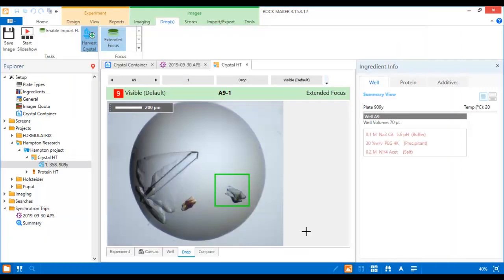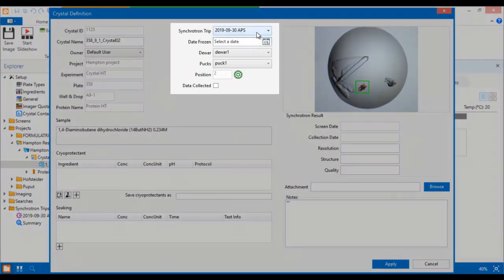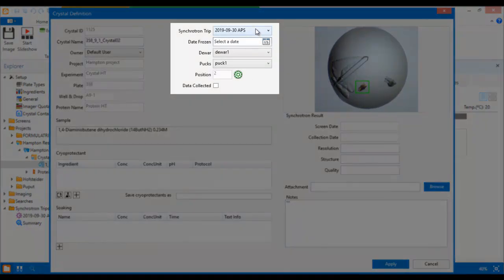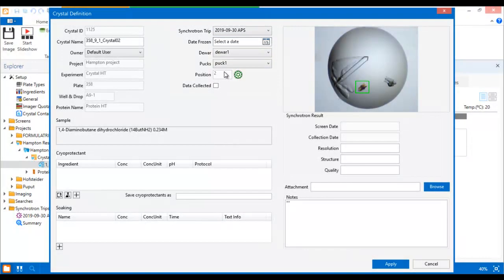Let's harvest another crystal. Because you are harvesting from the same well, RockMaker automatically assigns the second crystal to the same puck and doer that the first crystal is assigned to.